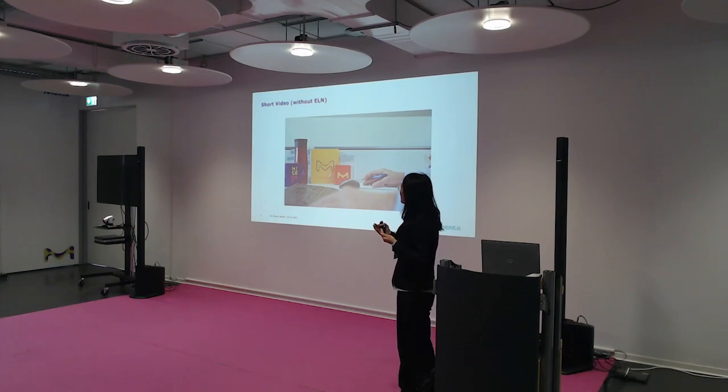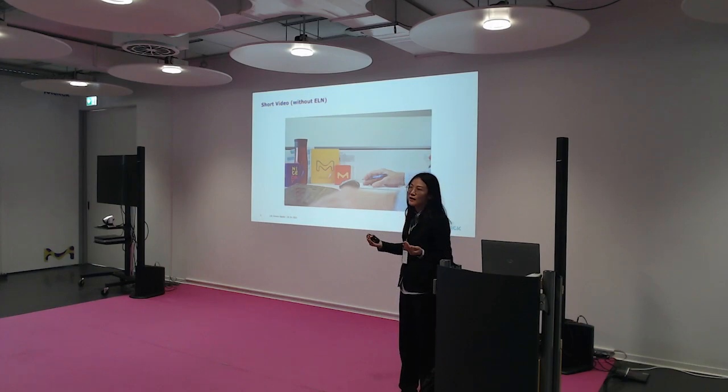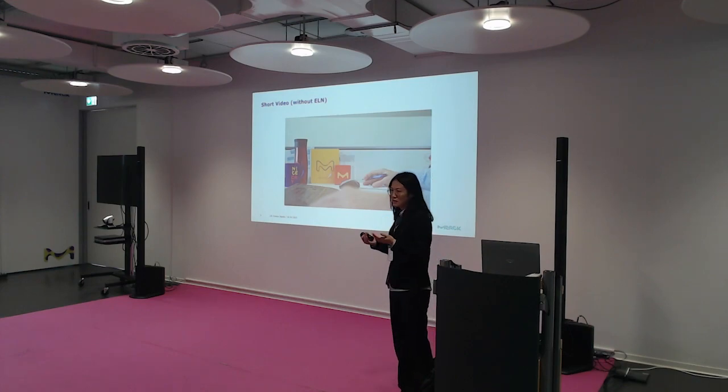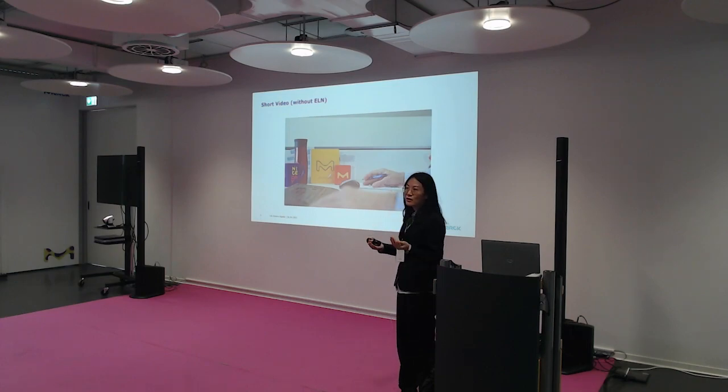So in this video, it outlines a general process. For example, the experiment design, experiment planning, and the recording procedures, data collection during experiments, and calculation and analysis, as well as the data review and verification before finalizing the experimental records.